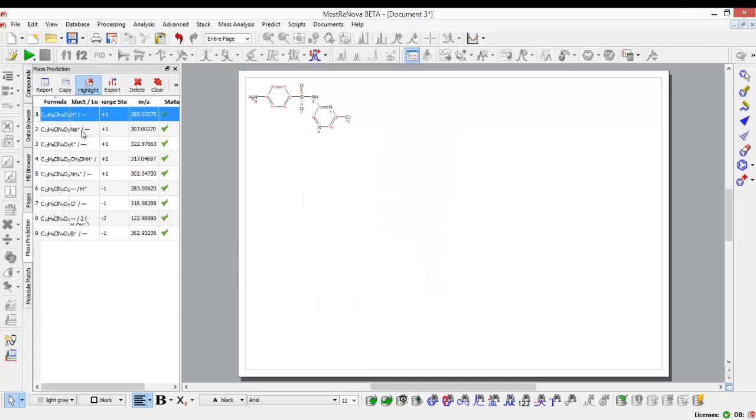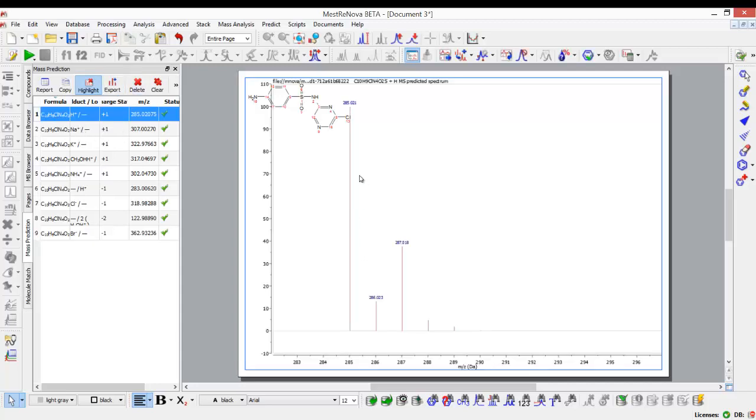For example, here if I go to the protonated compound, I click export, that will allow me to see what the MS would look like, and the isotope cluster is predicted as you can see here.